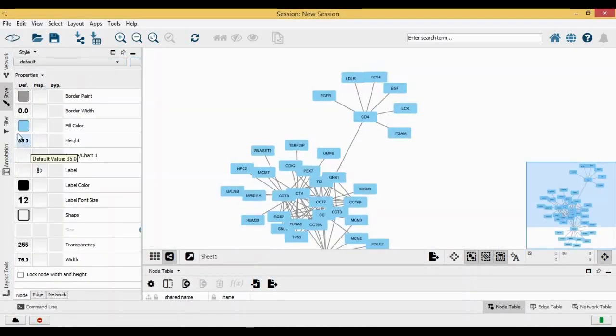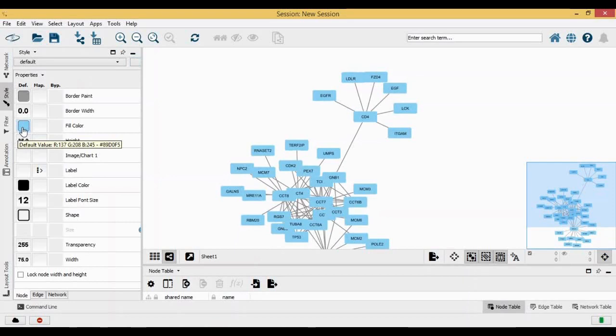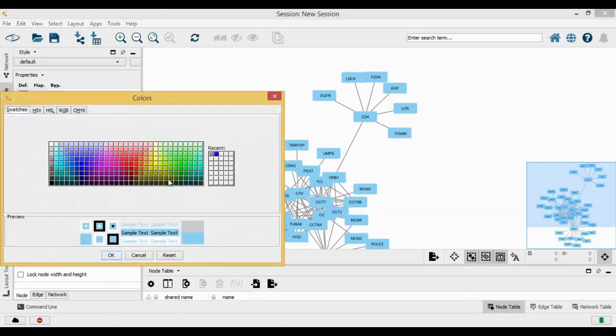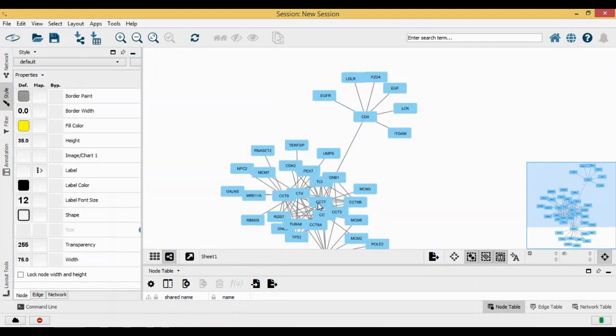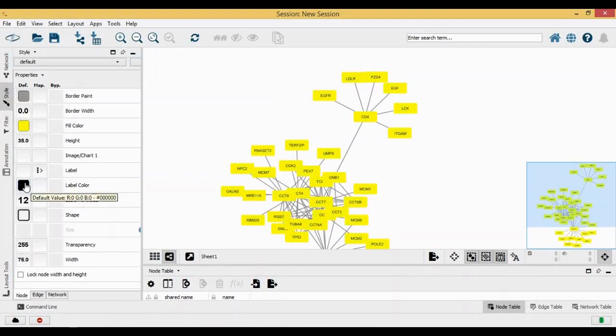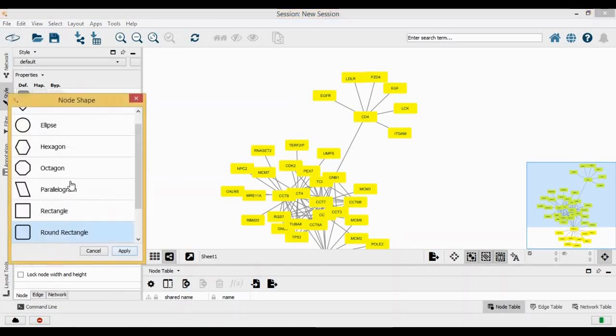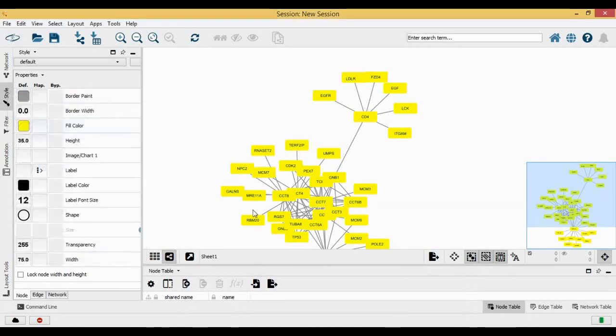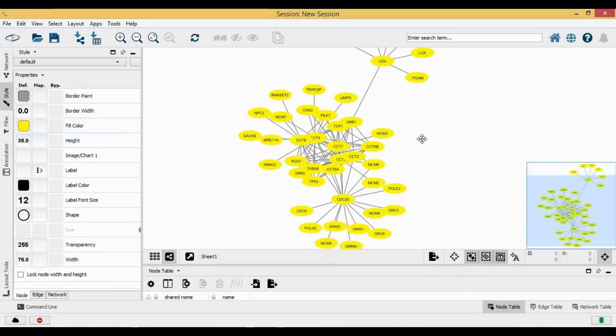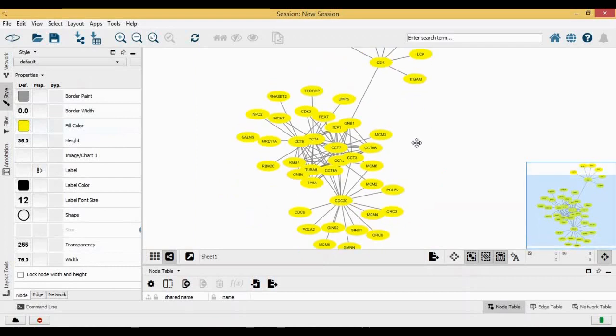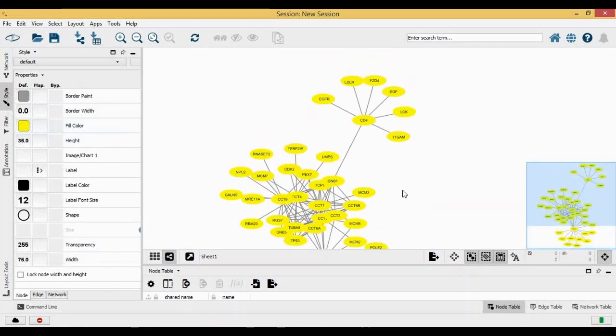Let's start with fill color. If I click on fill color and click on yellow, all your nodes have changed this color to yellow. Then if I change the shape and click on eclipse and apply, all the nodes change its shape into elliptical shape.